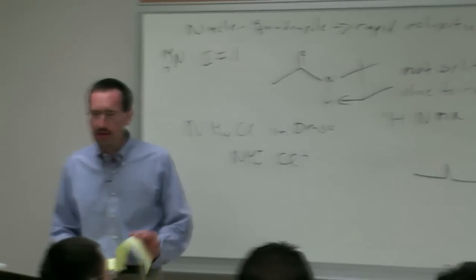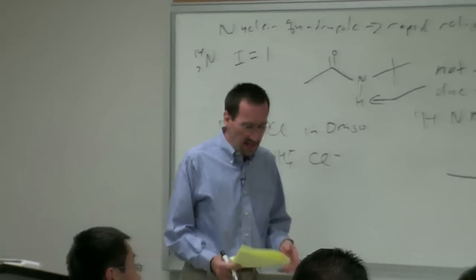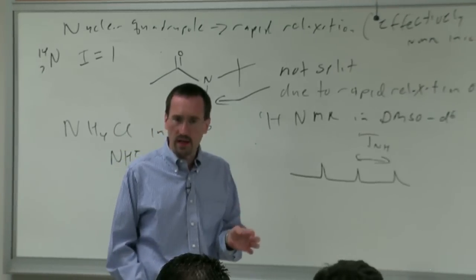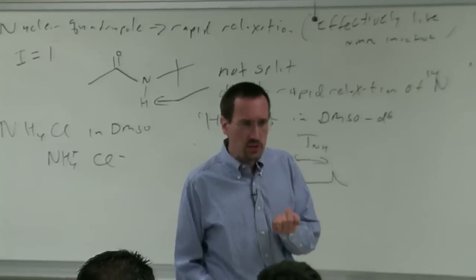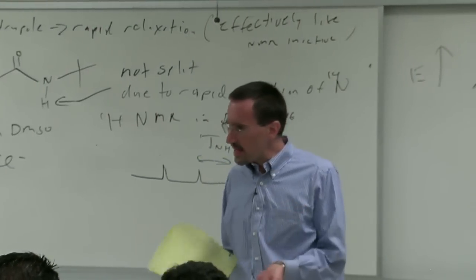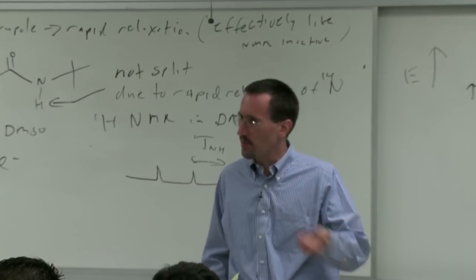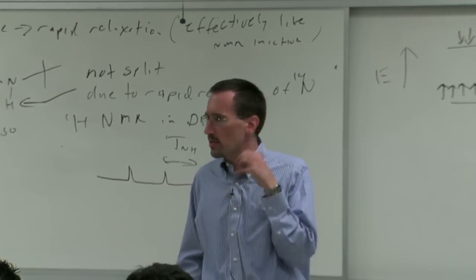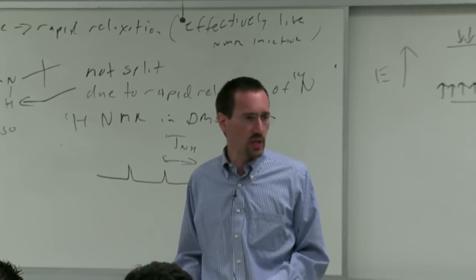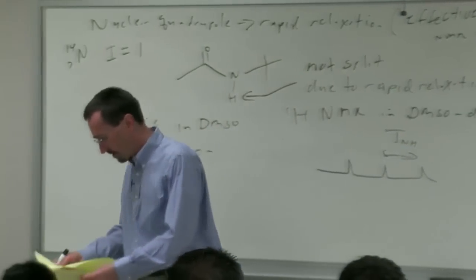So the first thing when you see NMR spectroscopy is you're getting dinged badly because the technique involves very little energy absorbance. In other words, when you're measuring a UV spectrum, it's very easy for a detector to detect the energy of a photon. And when you're measuring an IR spectrum, it's very easy. And already your detectors have to be much more sensitive. And it's going to get worse from there.